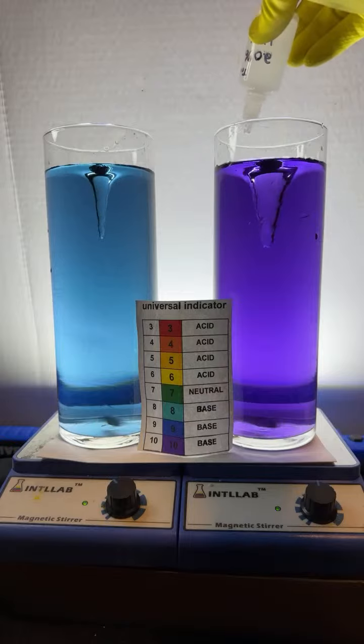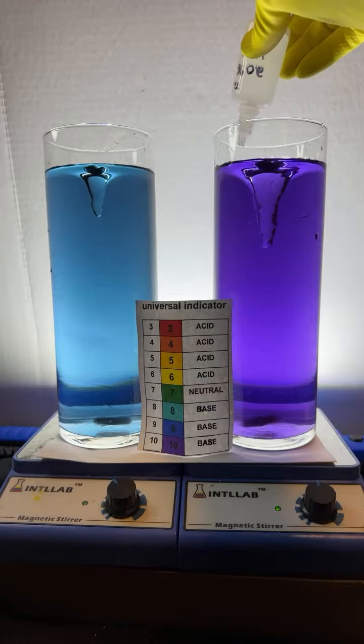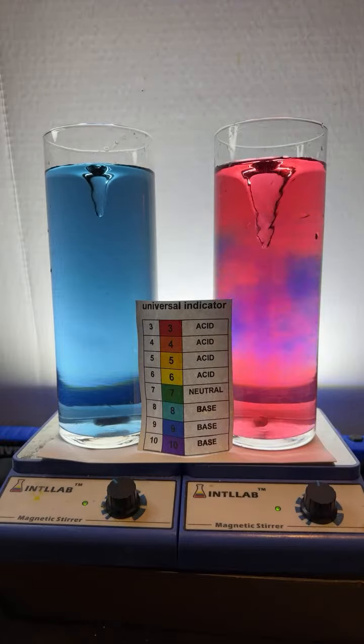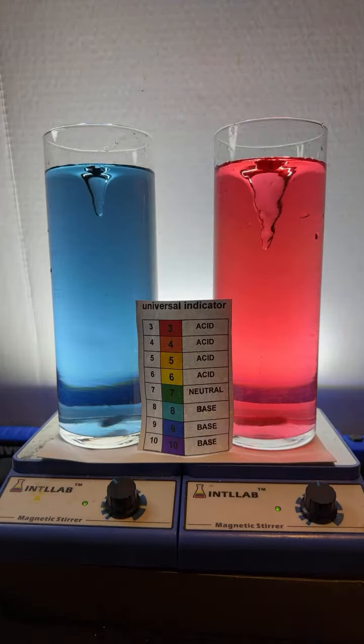Here, let's do another drop of hydrochloric acid on the right over here. You can see me adding it. There it goes. In goes the drop. It's like a little bit of the Northern Lights.